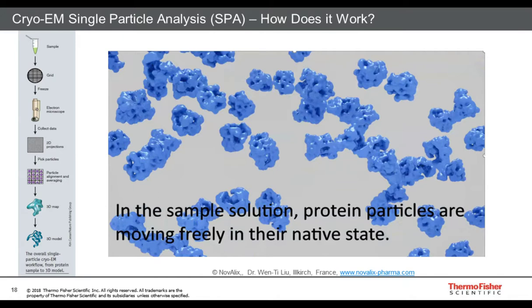On the first part, the biochemistry part, it's obviously important that the protein is expressed to sufficient levels in order to purify it. Once you have these sufficient levels, you need to purify the protein, get it clean enough, make sure that you get it to sufficient concentration levels, that it is also stable, that the proteins do not fall apart, for example. And ideally, if you isolate various fractions or various states of a protein, you would need to capture all these states within this purified fraction. That's of course a job on its own.